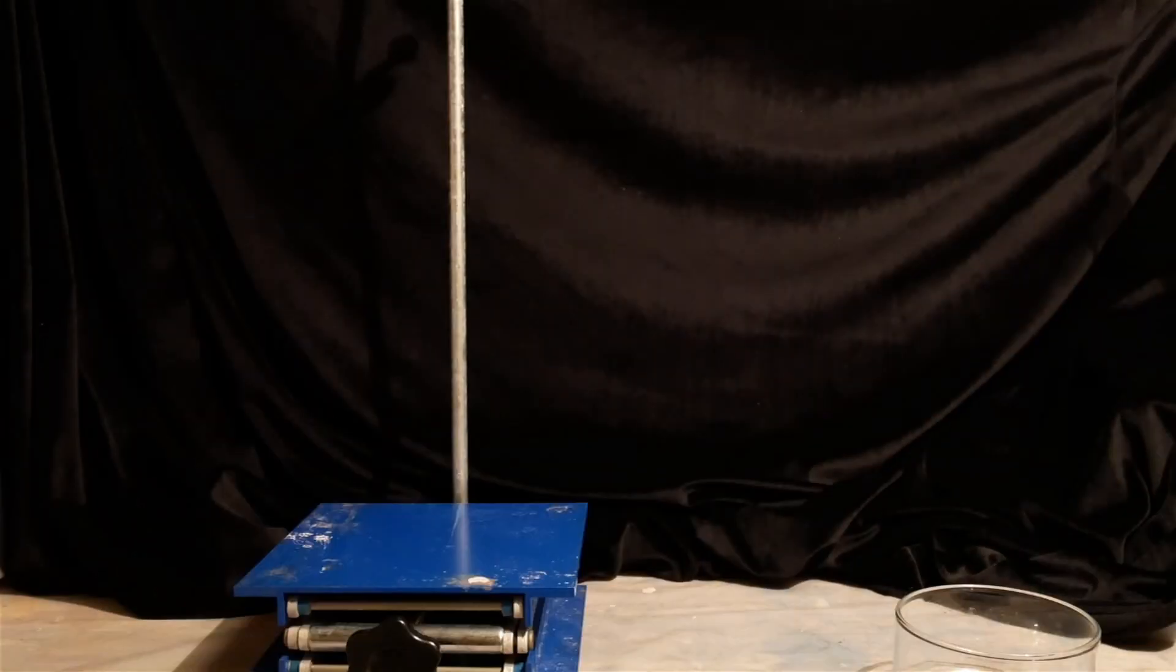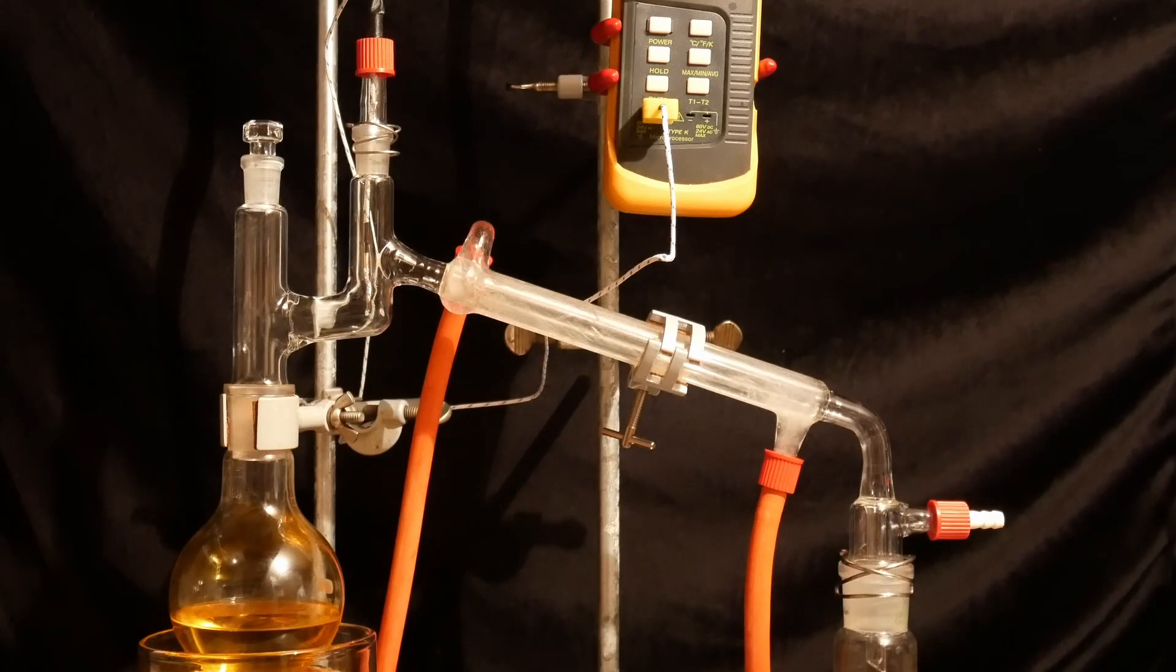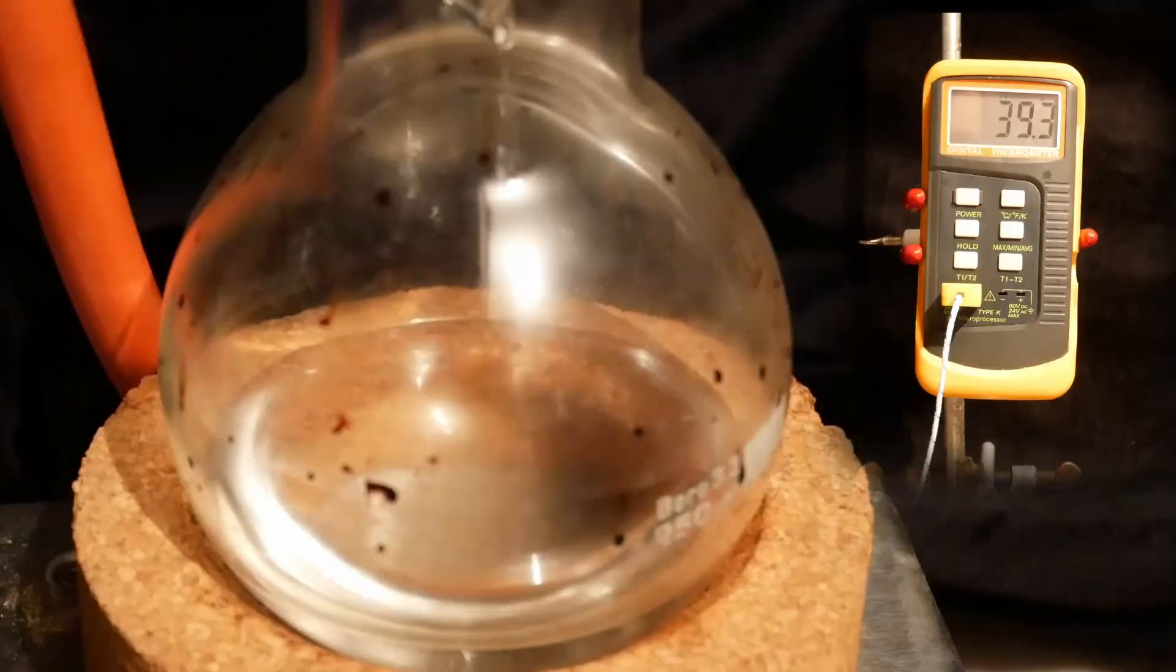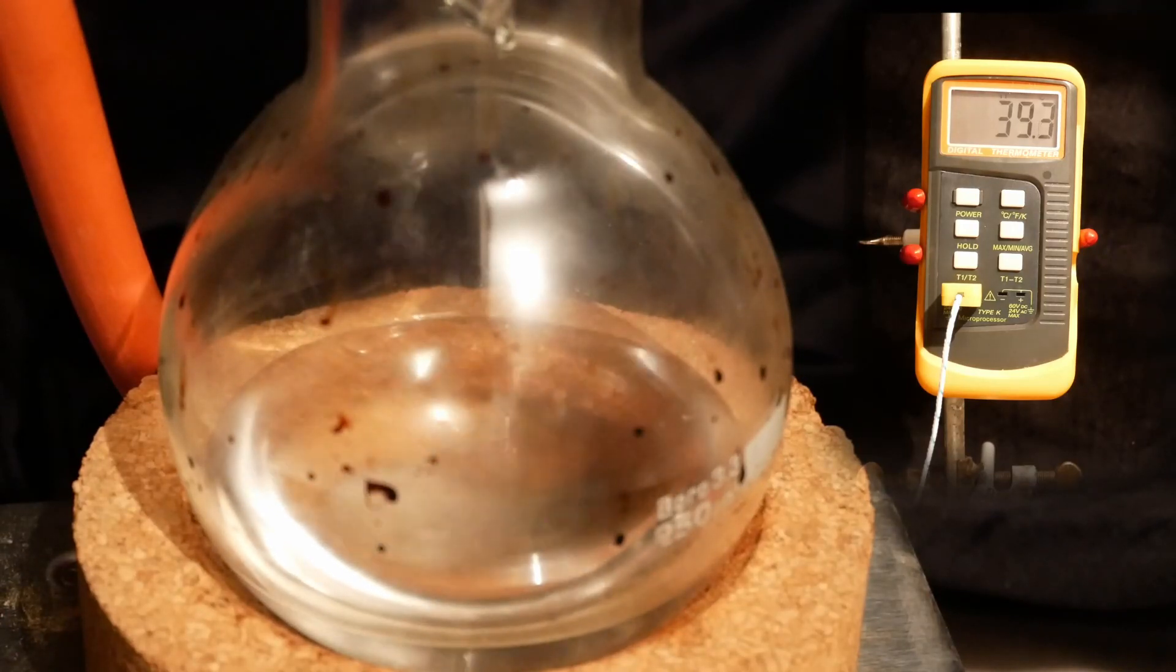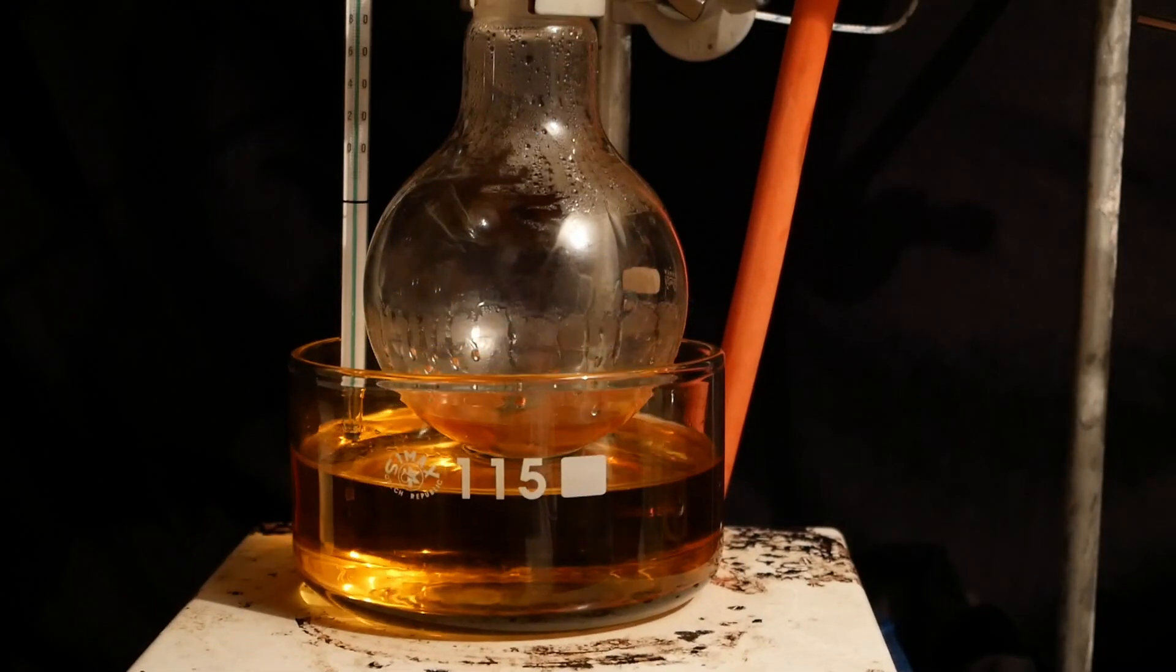A distillation setup is then assembled. The dichloromethane comes over first with a boiling point of 40°C. Once all of the DCM has been removed, we are left with a red, viscous oil in the flask.